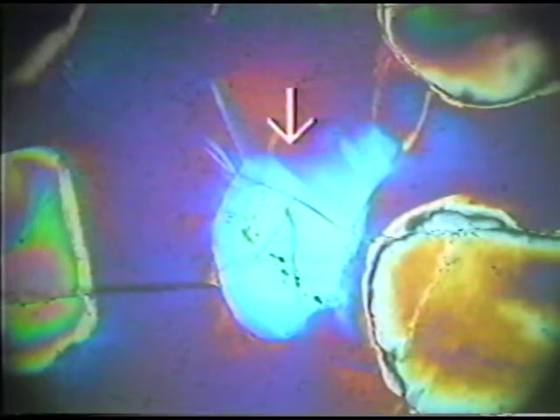This indicates addition of colors. And if it's addition of colors, then we know that the E ray is the slow ray. It has added to the slow ray of the accessory plate. There's been addition of colors. And in order to prove this, let me simply rotate the stage now. I'm going to rotate the stage 90 degrees.